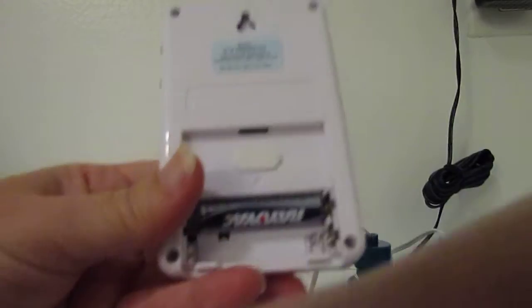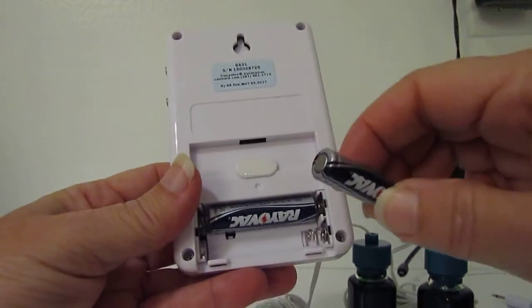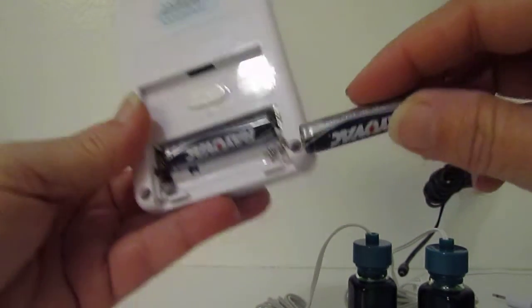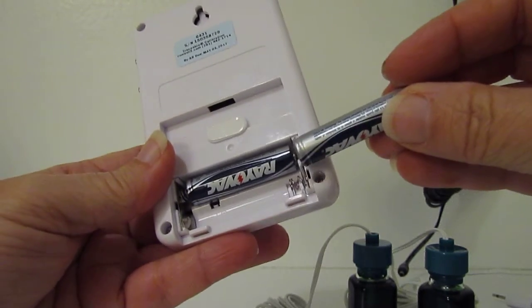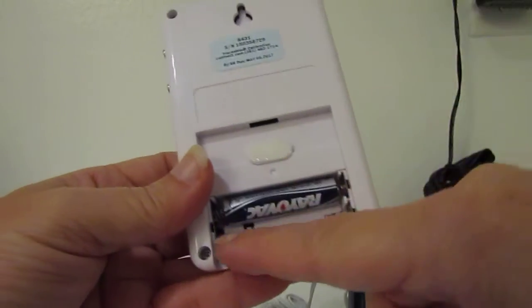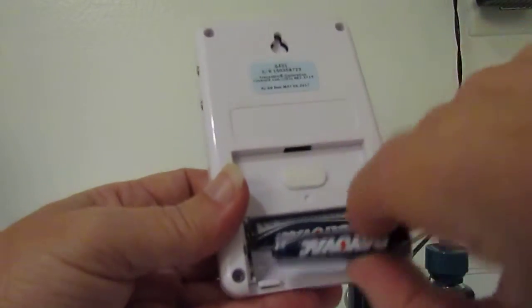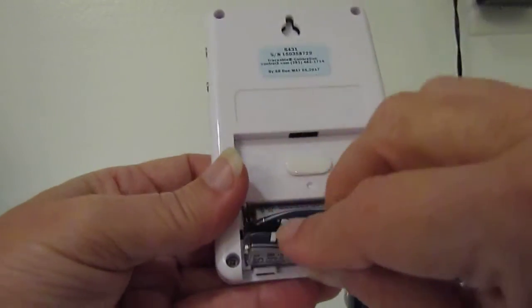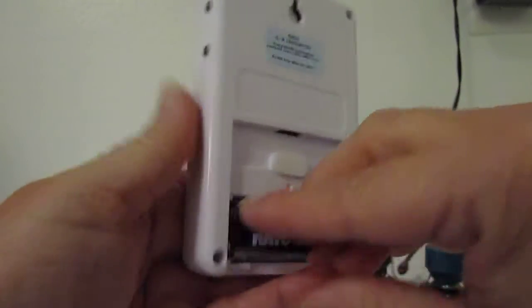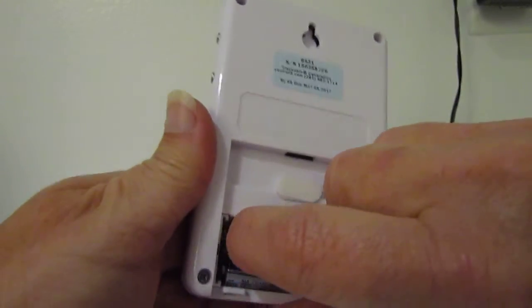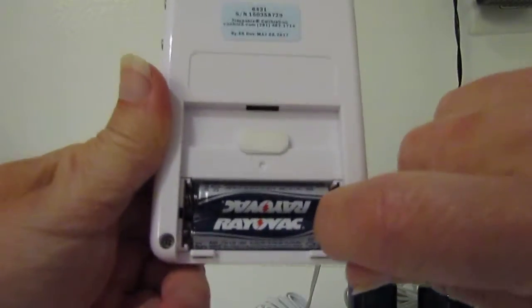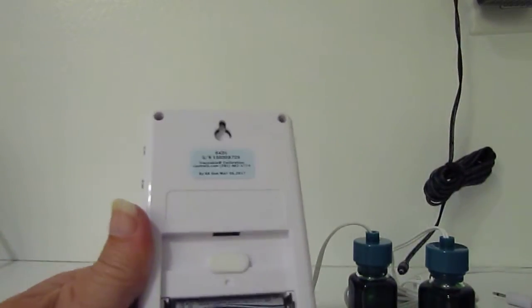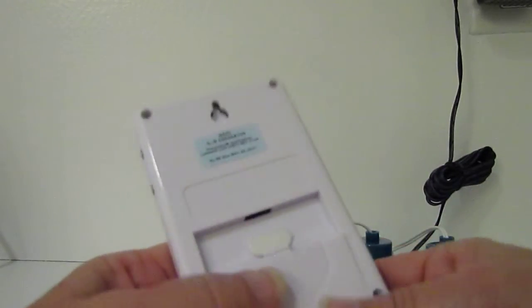It comes with batteries, but the first thing you need to do is - and I've already removed mine so I won't be able to show it to you - there is a little piece of plastic in here that is preventing the battery from operating. It's just a clear piece of plastic stuck in between the contacts for your battery. You just need to remove that and replace the back.